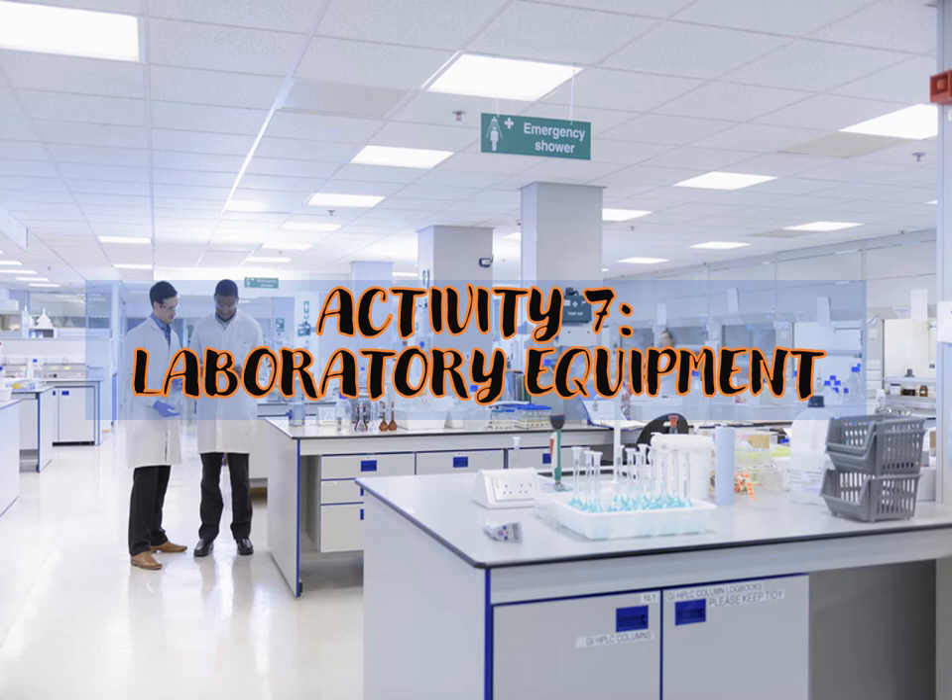A small laboratory may have a microscope, refrigerator, and centrifuge. But if a laboratory is quite big, it will have an assortment of equipment including instruments such as pH meters, autoclaves, balances, incubators, water baths, and even blood analyzers. For reliable test results, equipment used in the testing process must be operating correctly.